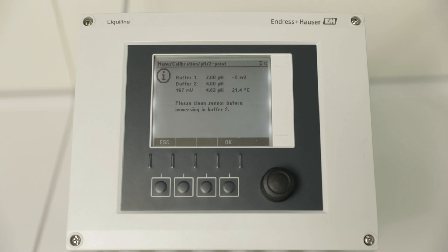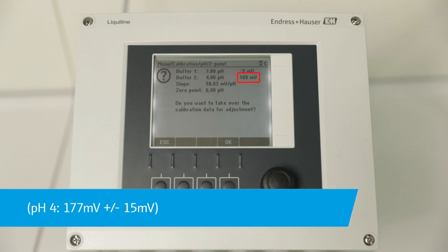Wait around one minute. Confirm second buffer with OK. The instrument waits for a stable measurement value again. If this is given, the value is taken over automatically. Check the display raw value. For a buffer with pH 4, it should be around 177 mV plus or minus 15 mV.